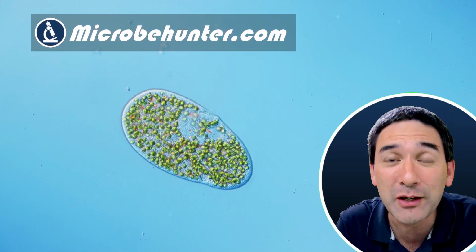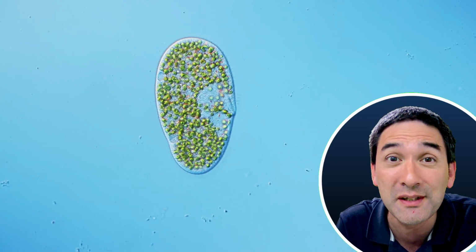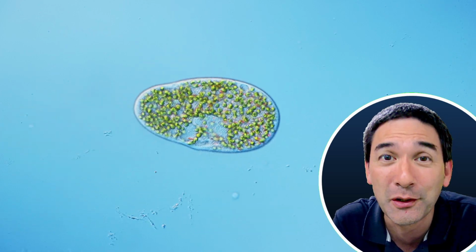The name of this microbe is Paramecium bursaria. It is a water microorganism. It is a single-celled protist. It's completely harmless. I found it in a pond and simply put it under the microscope.